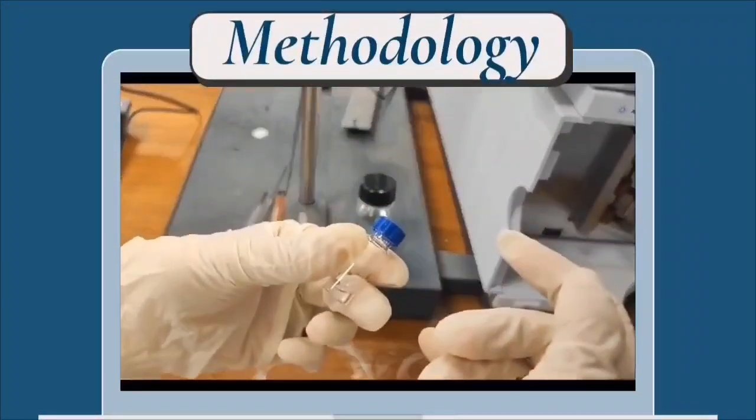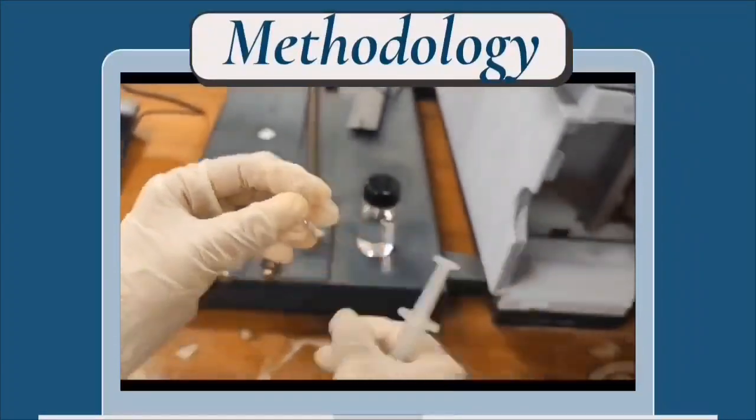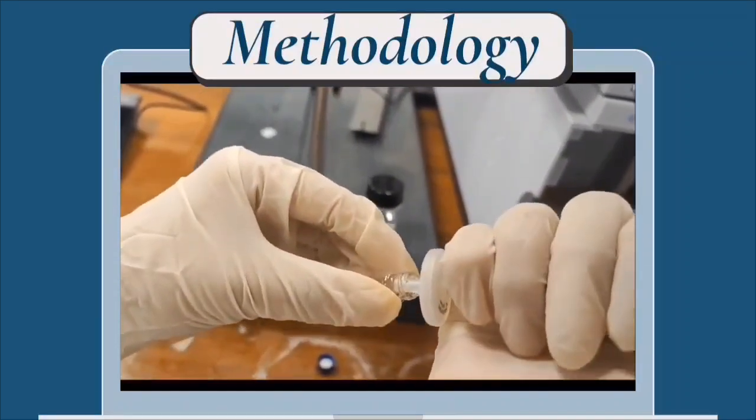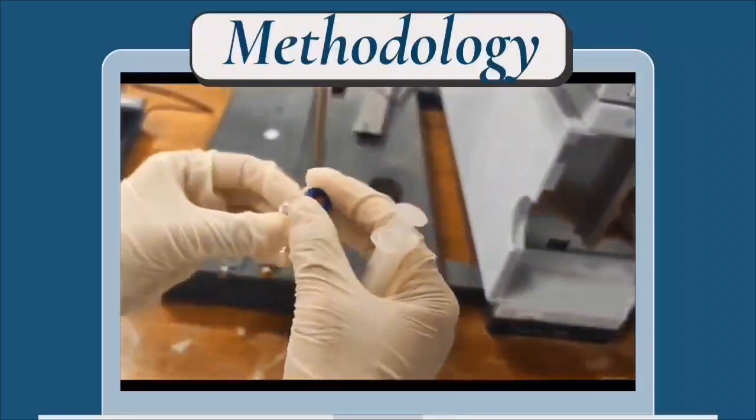Now we are going to put our sample into the vial for our next step.